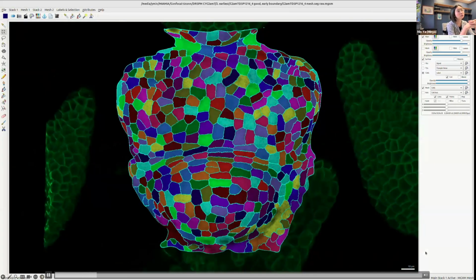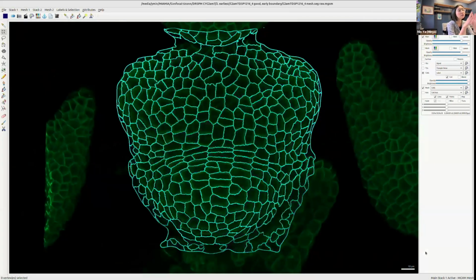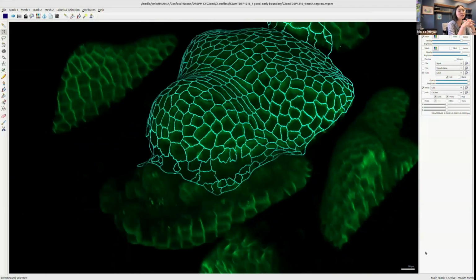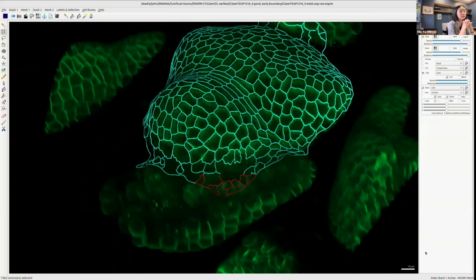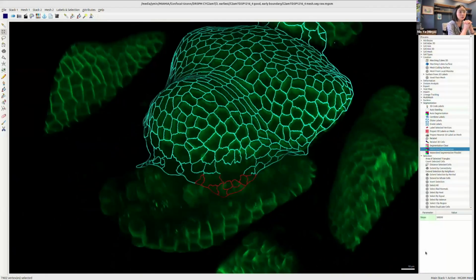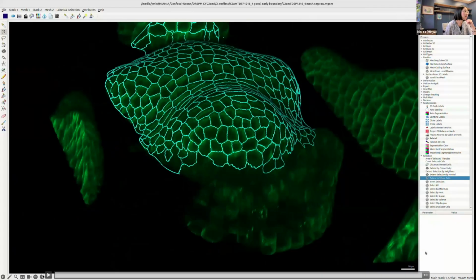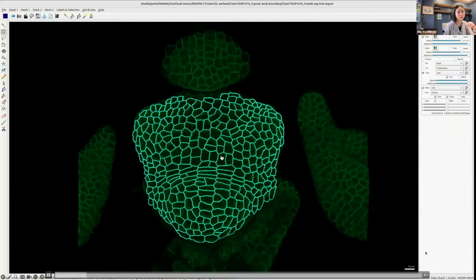The last step is that we're going to remove the edges, because you can see the edges are really messy and don't really have cells to be segmented. So we want to clean up everything before we do any analysis. This process is quite similar to what I just said. You select some things, you extend to whole cells, but instead of clearing the segmentation, I would just delete it using the scissors on the side tool. And in the end, we end up with a sample like this.